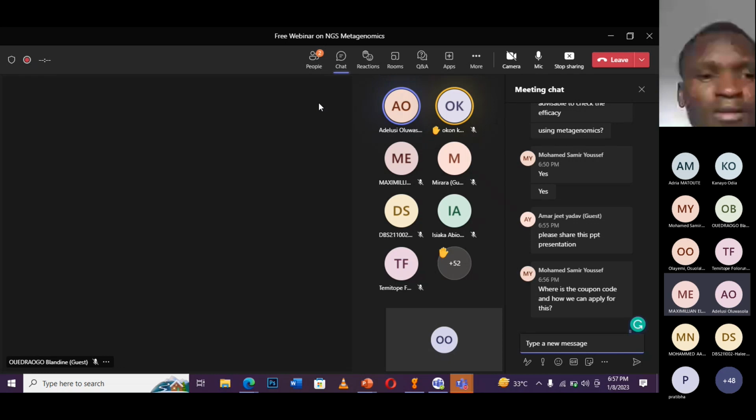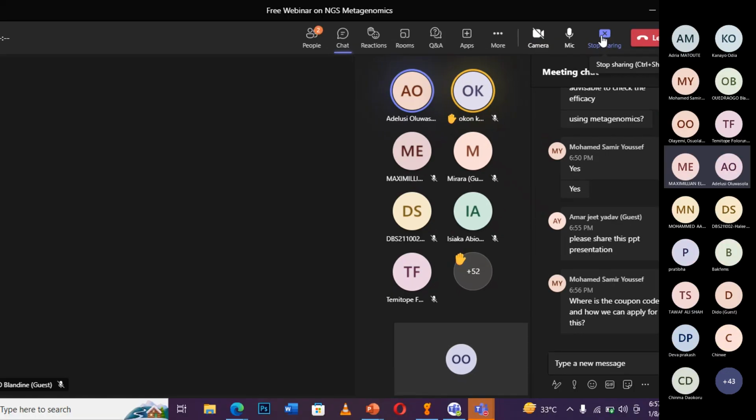Am I going to culture the feed on a plate, or will I just do the analysis from the feed itself? Culturing from the plate, or the feed itself.